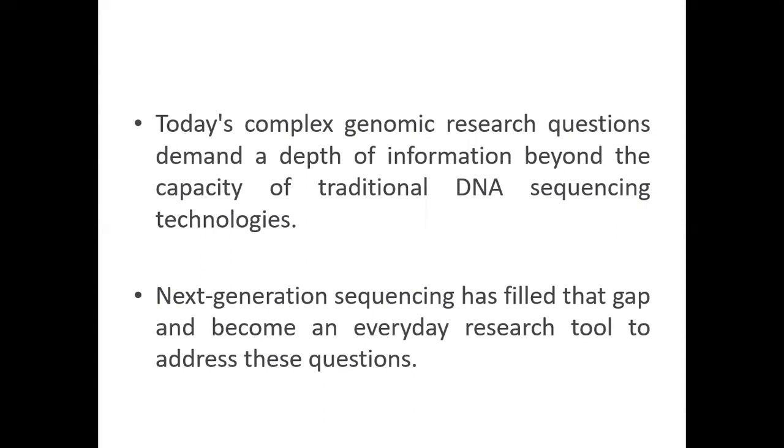Today, a complex genomic research question demands a depth of information beyond the capacity of traditional DNA sequencing. We have said that traditional DNA sequencing was Sanger sequencing, but now we can sequence thousands of genes at a time. So next generation sequencing has filled that gap and become an everyday research tool.